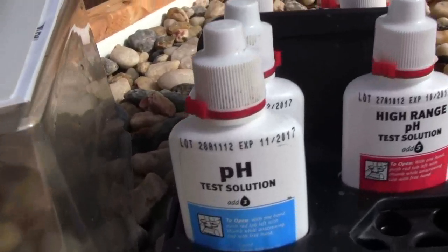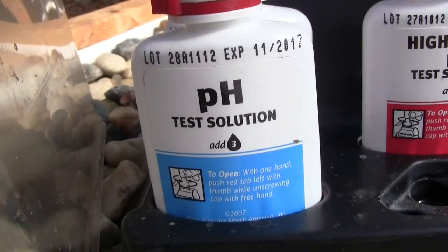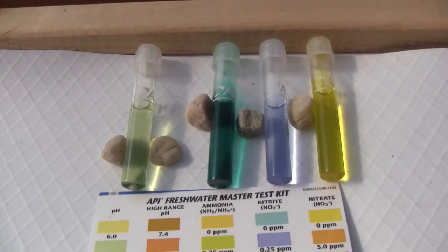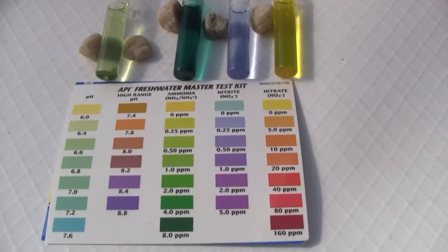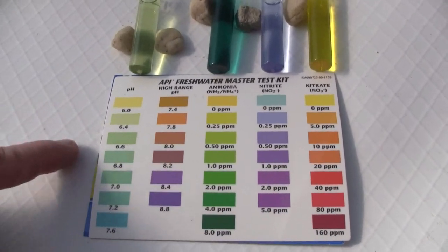Here are the test kit solutions, and like it says on the label, for this one — the pH test solution — add three drops. The four vials, you fill them up to the white line, you add the correct number of drops, and you get a different color. Then you review the chart and match the color in the vial to the color on the chart.